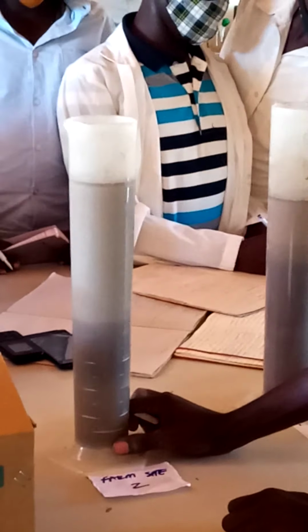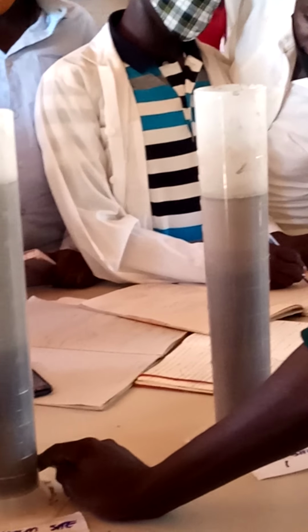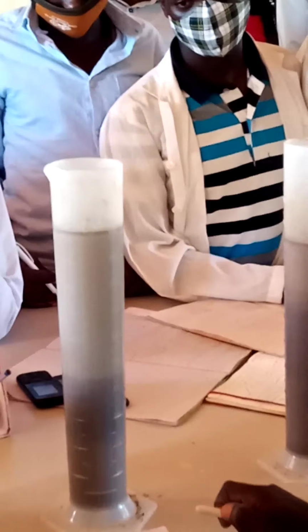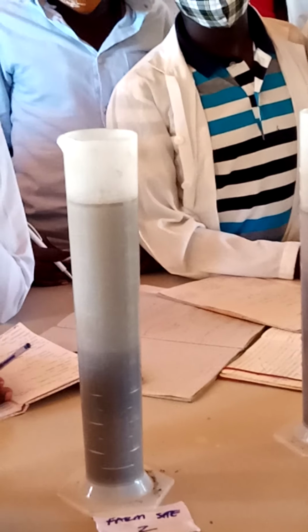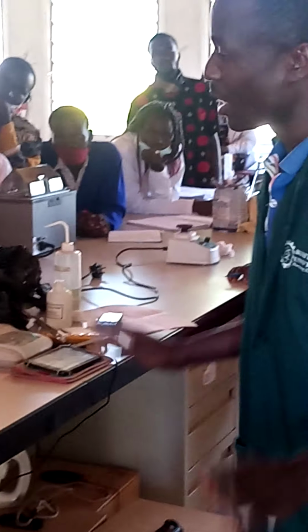This one you see is sand. Because they are heavier, they settle fast, followed by silt. When we talk about soil texture, we have three things that make it. We define it as a proportion of silt, clay, and sand. So those three make for you a soil complex, which is either going to be silt loam, clay loam, and others.